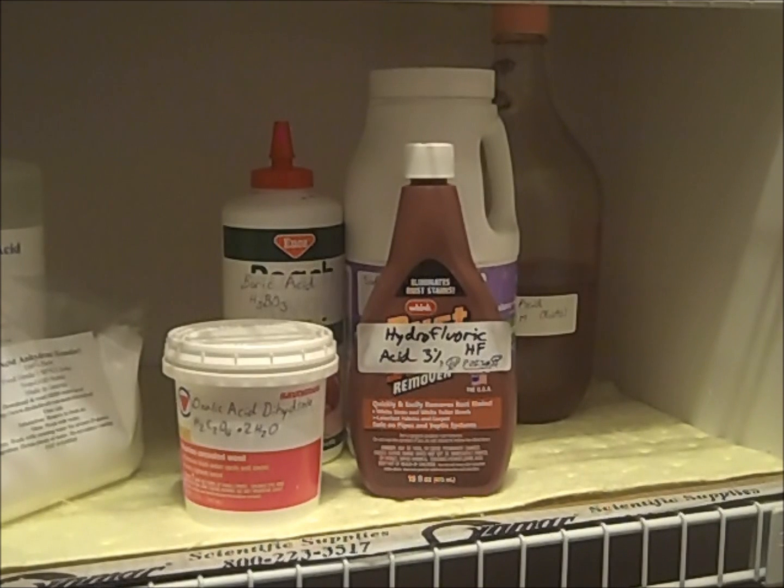We continue to the rest of the acids. On the far right is sulfuric acid, sold to the amateur as Rudo Professional Drain Opener. This is a 17.9 molar aliquot that is sold at Ace Hardware for the purpose of drain cleaning. It appears brown on camera because it is viewed through a very thick layer. However, when used conventionally in beakers and flasks, it exhibits no color and is essentially colorless. It is in a glass bottle with a PVC coating and a yellow cap for easier and safer storage.